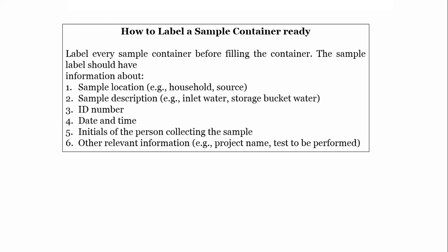And that is why sometimes when you are going to the field, you will need GPS coordinates also to include in the report, because at the end of the day, if you want to do a kind of water distribution map or maybe a water sampling map, we are going to need these coordinates to be able to map out our zones of work, where we actually collected samples. We can also use this map to build a database of the locations that are highly contaminated in our communities. Because once you have the ID, like the geographic location, you can build this map from your results. After the result from the lab, you know that this sample came from these geographic coordinates, and we can use those coordinates now to build a sample location map or a risk analysis location map. So this is just part of it. That is why labeling the sampling container is very important.